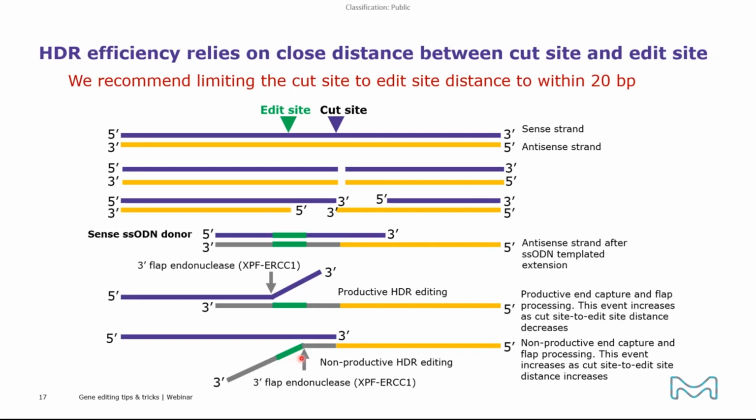And the probability of a non-productive HDR editing event increases as the distance from cut site to edit site increases. And besides this DNA repair step, other factors may also contribute to lower editing efficiency as the distance from cut site to edit site increases.